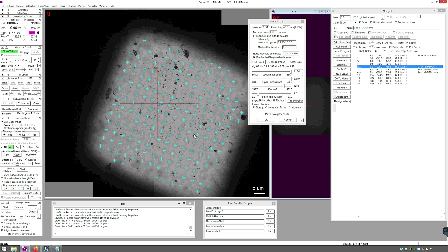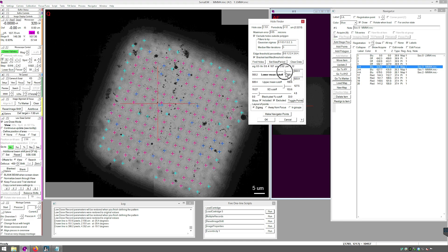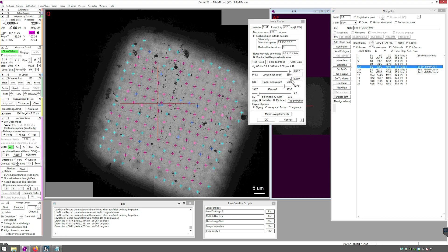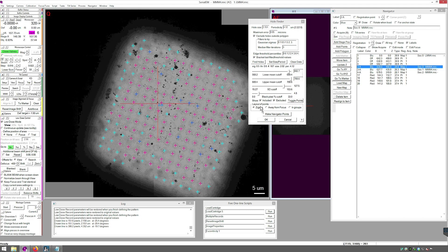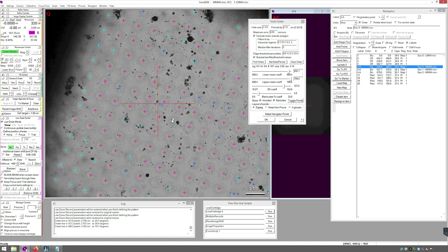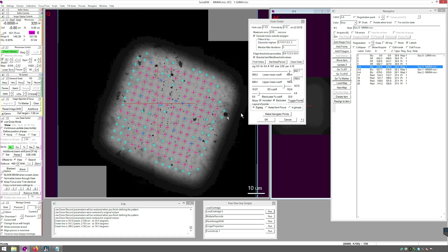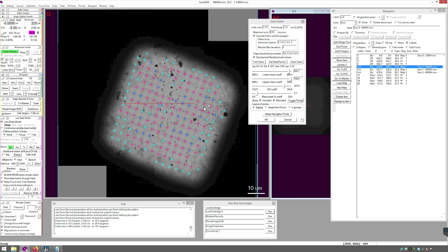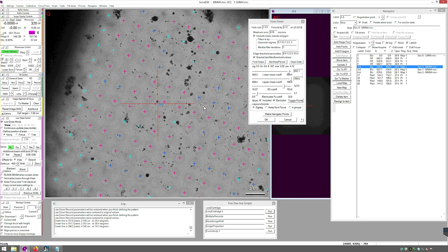The Hole Finder has found all of these holes. Since they are cyan, they are being excluded. The Excluded toggle box is right here — we need to adjust the sliders to select our points. Pink is selected. So these points are now all selected, except for the ones in the periphery, which is OK. The ones not being selected have too much transfer contamination in them.